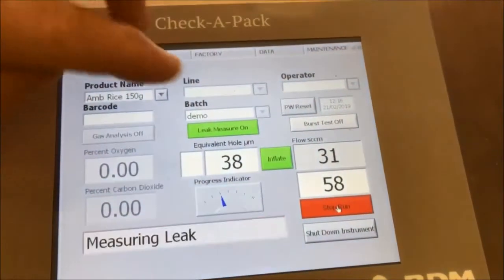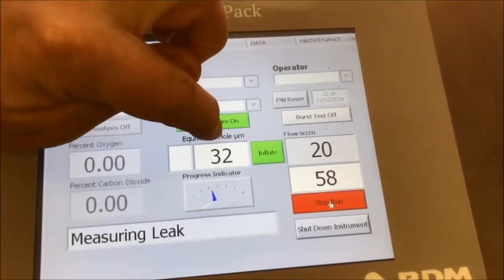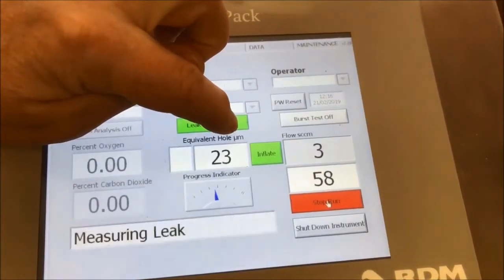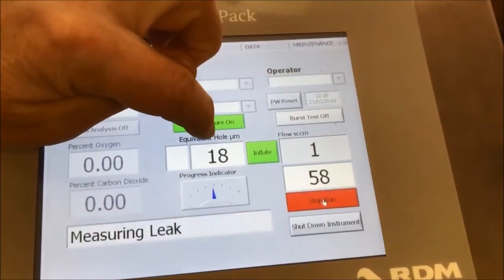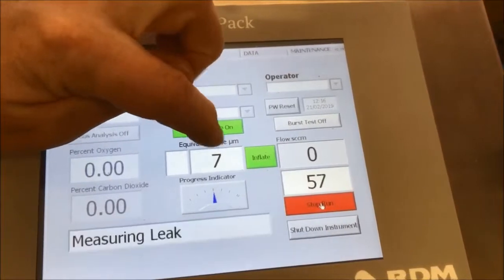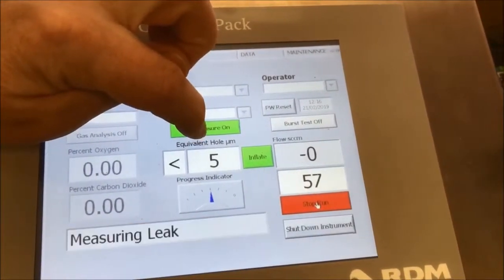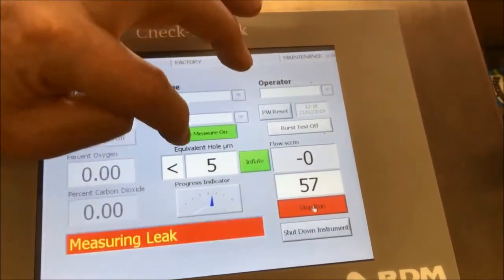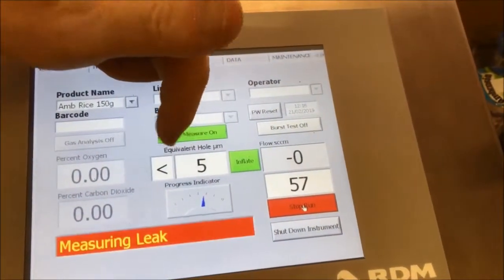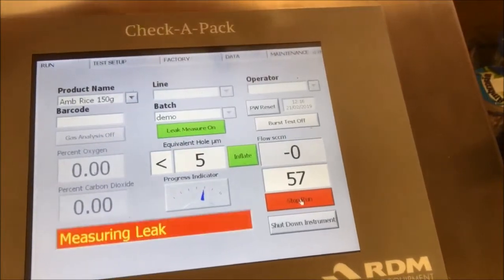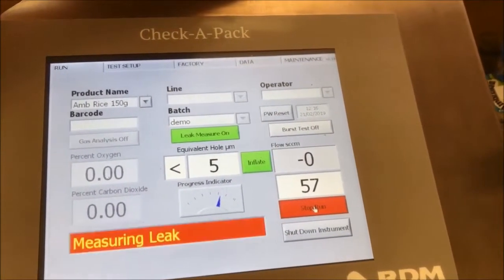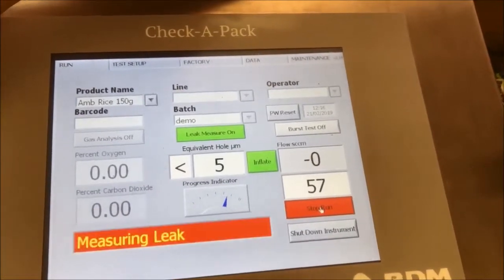Various numbers on here, but really the most important number is this number here. This is the equivalent hole size in microns. This is telling me that this pack—it will tell me in a minute once it's settled down—what the hole size is for that pack. I can see straight away that it's below five microns, so that's really below the level of detection. It's a very, very small hole size.